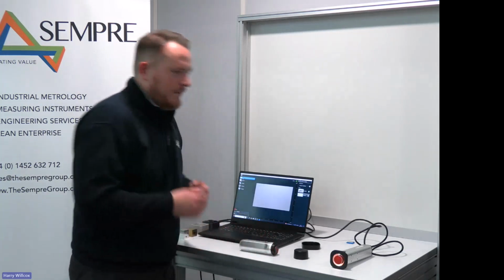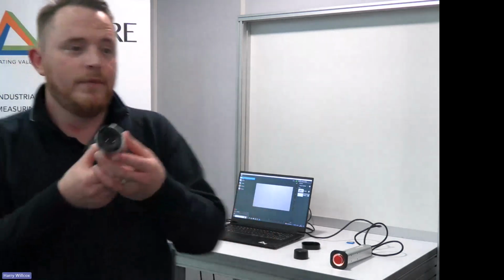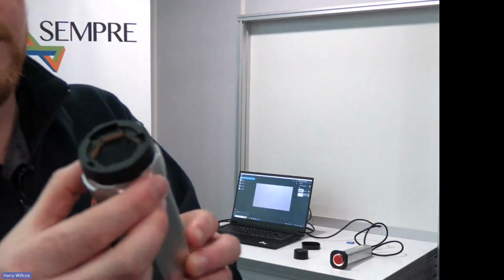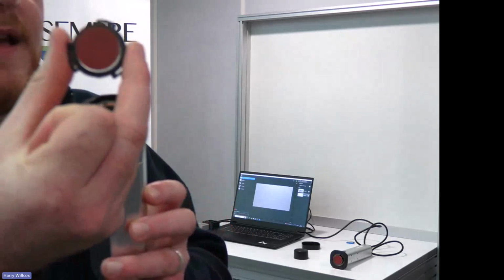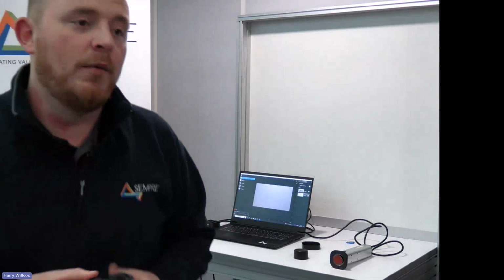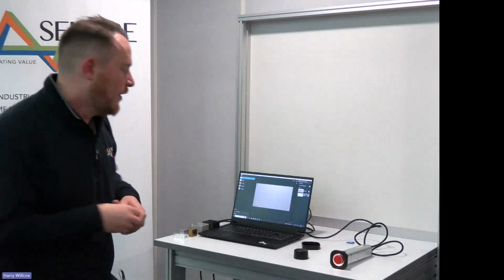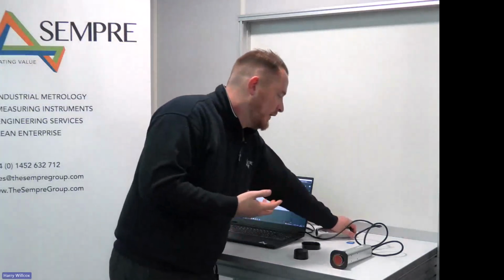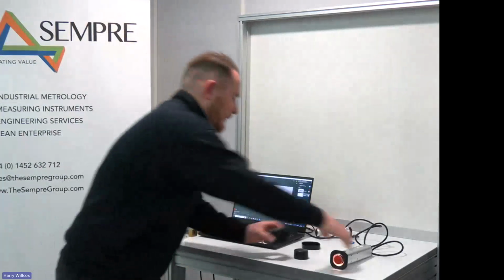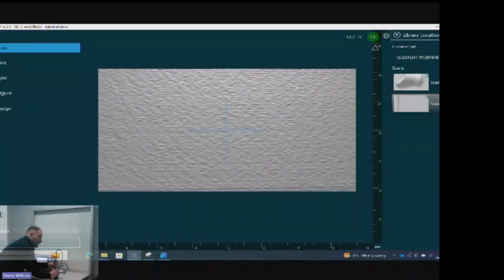So the way that the pads work is we've got a coating on the end of the pad. If I take the lid of the system off, and hopefully you can see it okay, I've taken the gel pad off, and we can see effectively our optical system here. The pad itself has a coating. We can see on one side it's got the coating and the other side it's clear. So effectively what we're doing is we're reviewing the deformation of the pad on the reverse side, which is why when we take a sample, whether that be a matte black sample, so I've got a matte black block here, which is an additive block, if I place that onto the system, we can see the texture.